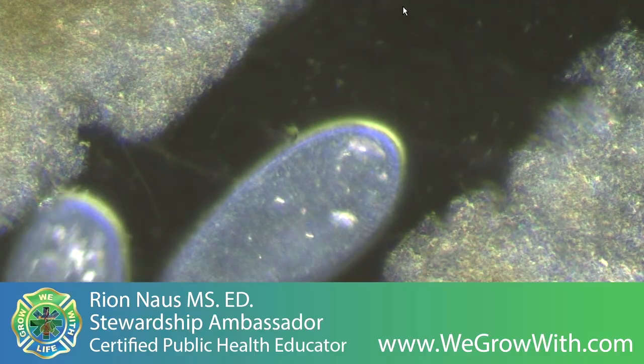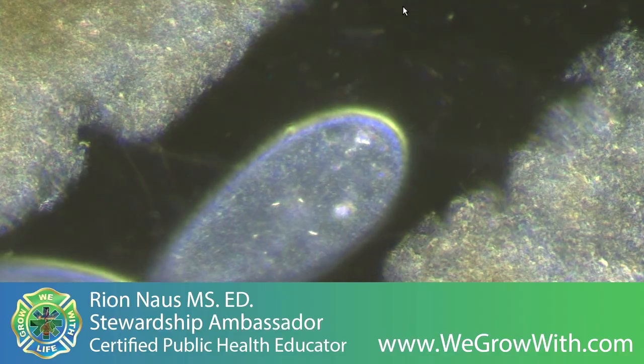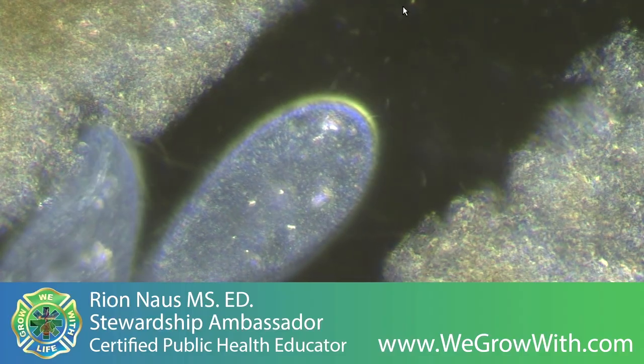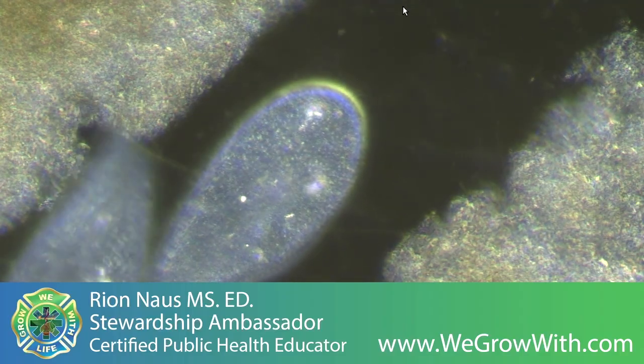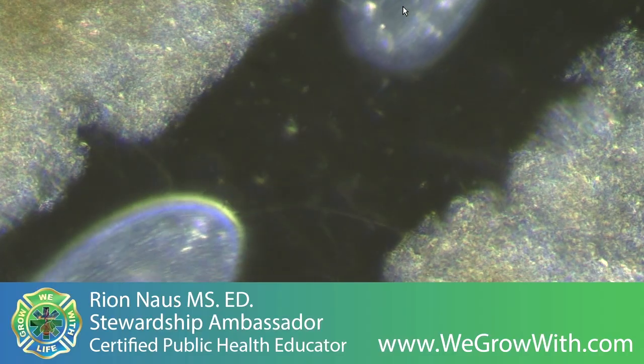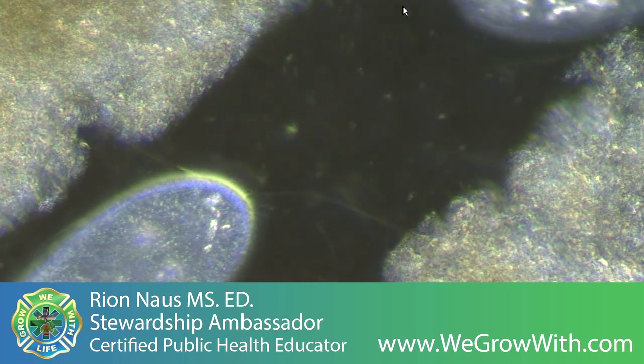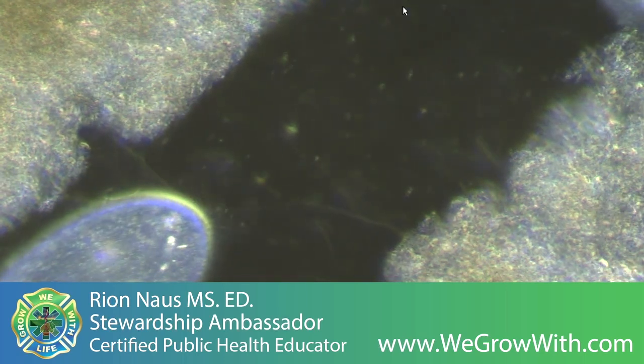So all of these are cues of what's taking place and changing, and then signaling for the creature itself to morph, to change, so that it can actually survive this insurmountable moment.